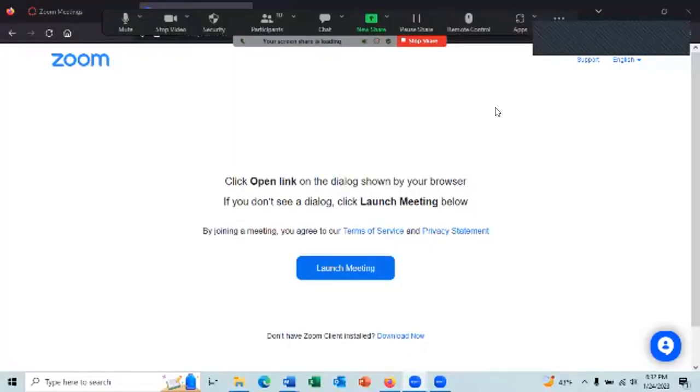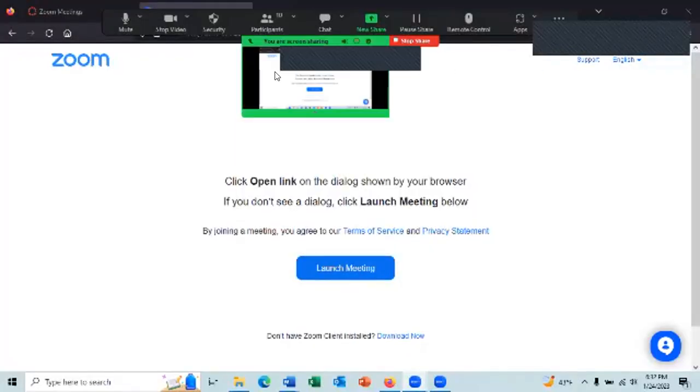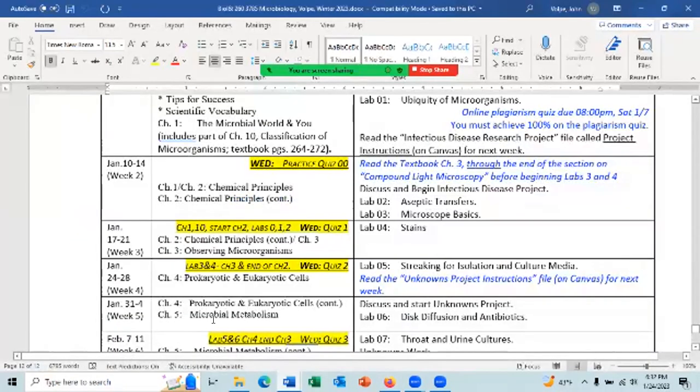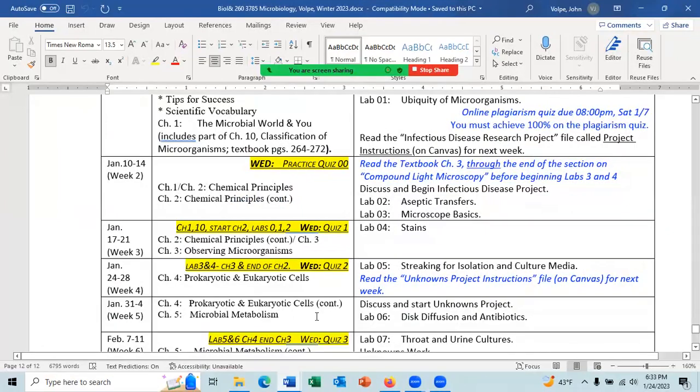I don't think I need to say anything other than what we're going to do. Today we're going to be talking about Lab 5, Streaking for Isolation and Culture Media.